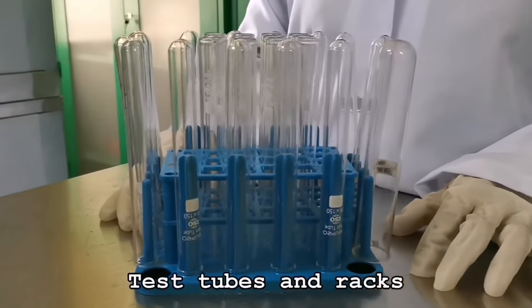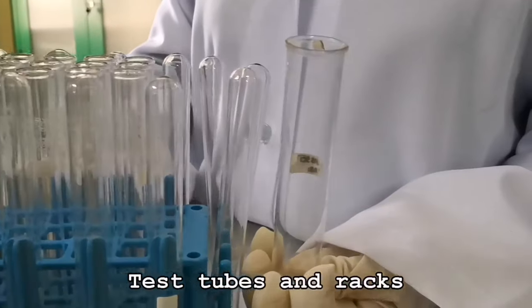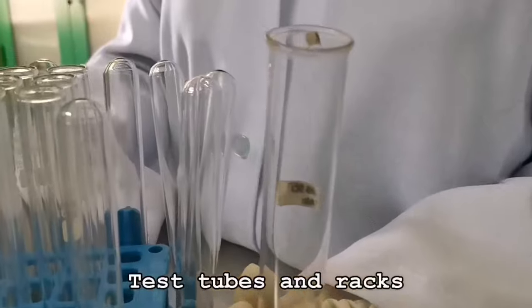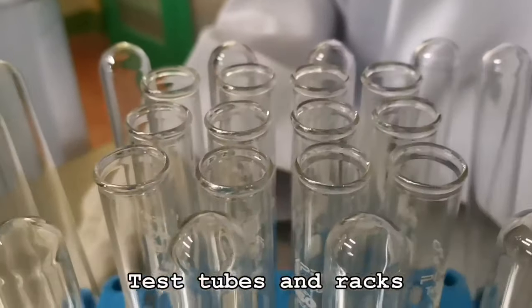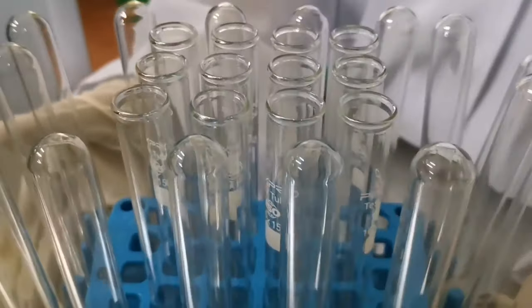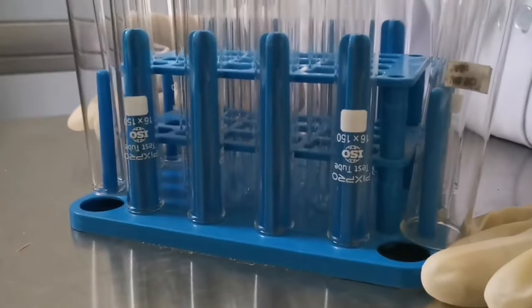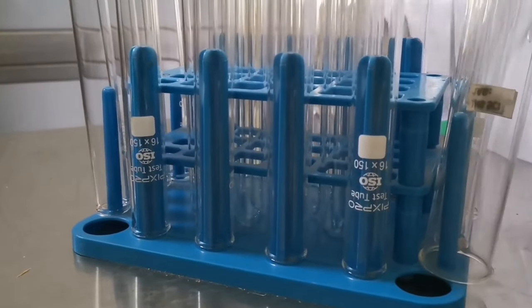The test tube is one of the most commonly used pieces of laboratory ware. Test tubes are the perfect shape and size to hold small amounts of substances, usually liquid. Test tubes don't stand, so they need a rack to keep them upright.